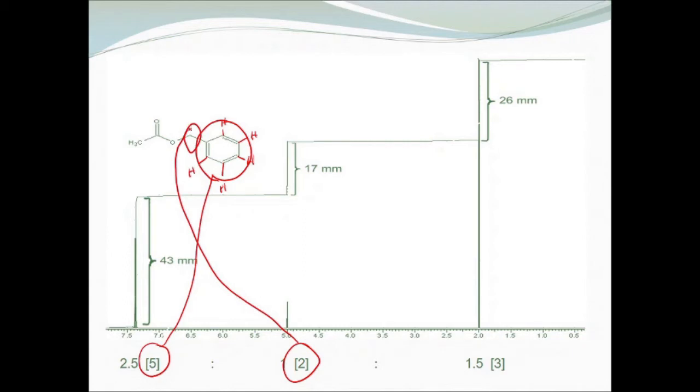That is a CH2 group. And out here we have 3. And again, this corresponds to a CH3. And if we look at the chemical shift here, 2 is where we do expect to find a hydrogen bonded to a carbon next to a double bond. And again, a carbonyl double bond.